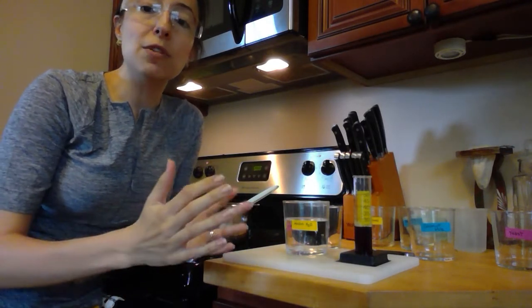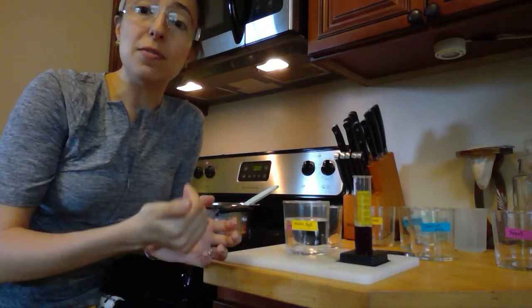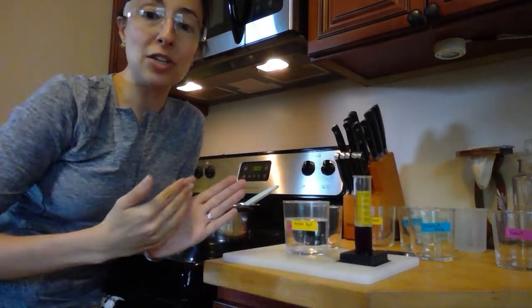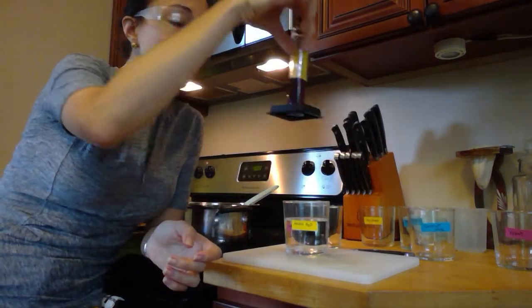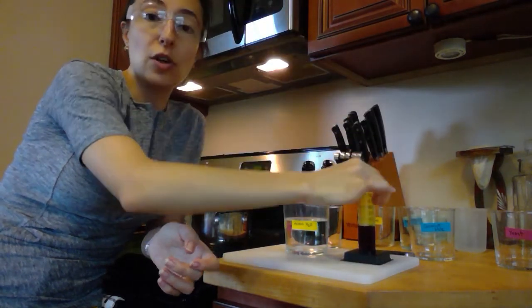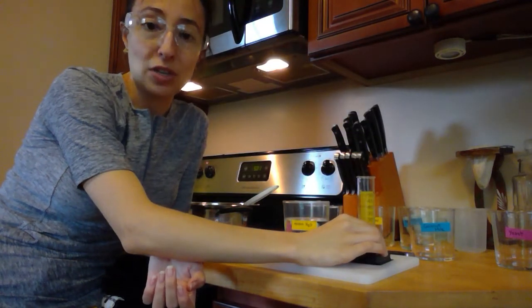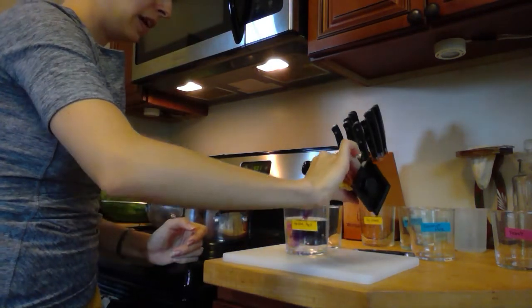And so having that difference between the red on the very acidic side and the green-yellow on the very basic side can give us a good range in the color spectrum to see what's actually happening. So knowing that I'm starting out with a very deep purple color, I can see that's very close to the 7 on this cabbage indicator scale. And so sure enough, I'm just going to go ahead and add this to it.